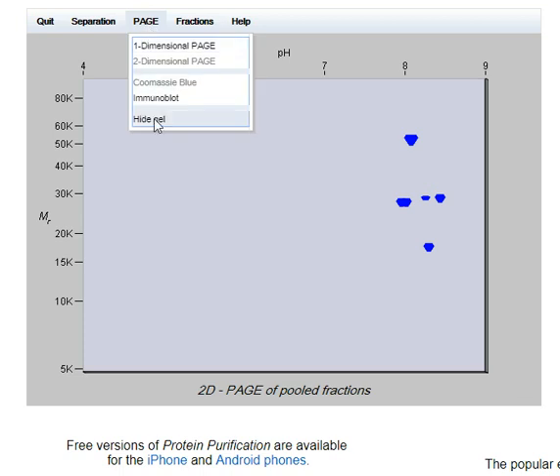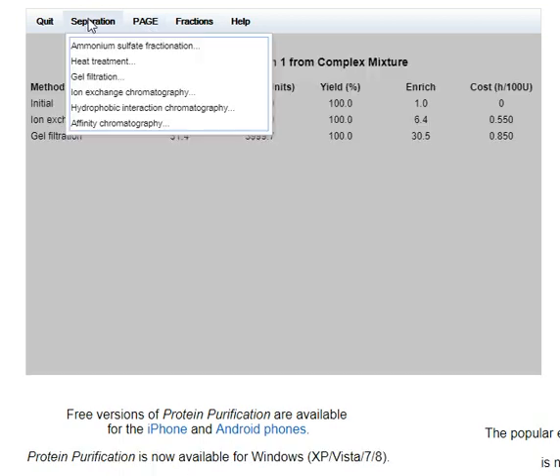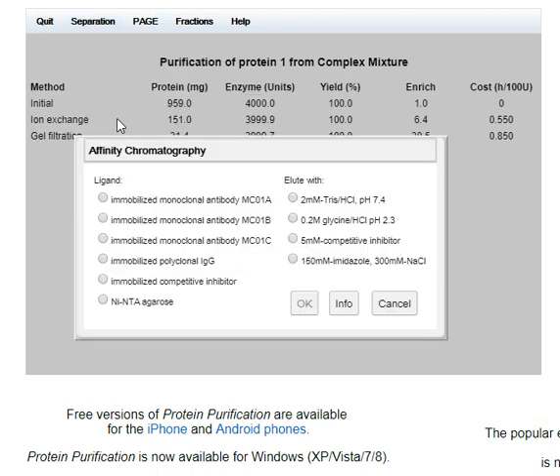I'm going to try something else — affinity chromatography, which exploits binding for specific groups. This is where expertise and insight would play a big part, but I'm really just guessing. I'll just take the first two options. There is information here which I read through, but I'm just guessing about quite a lot of this.